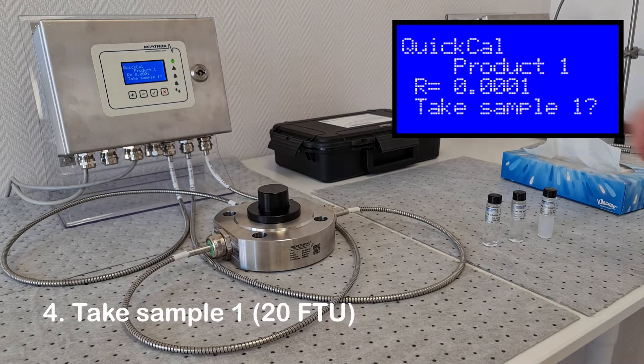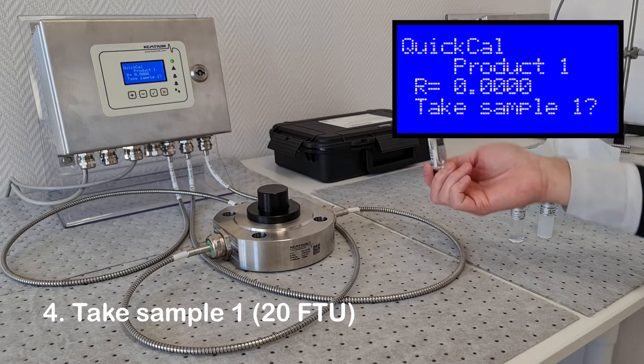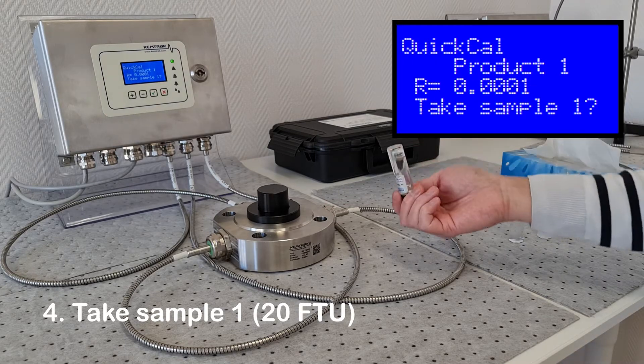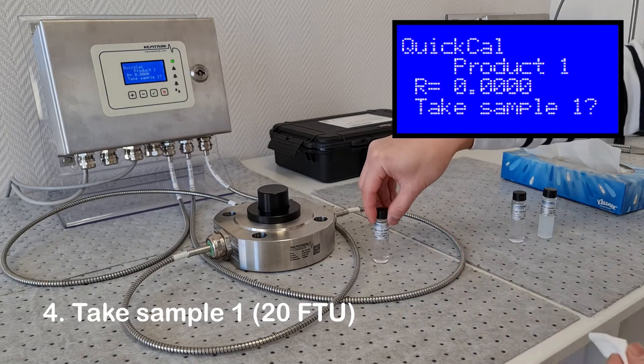The first calibration standard will be 20 FTU. To ensure the standard is dispersed, invert 10 times before placing in the holder. Do not shake the standard, as this will introduce air bubbles which will interfere with the measurement. Clean the vial, then place in the holder.